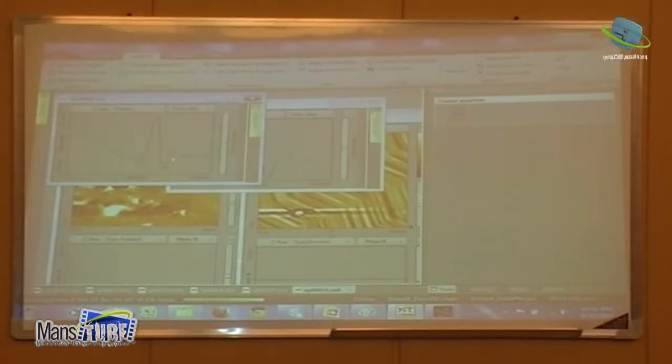And this is, let's say, the depth of my hole, from here to here. It's about 80 nanometer. So I make an 80 nanometer hole, and then the material outside, from this side and from that side. In total, the volume up is much greater than the volume down. Including the material, it's like 250 nanometers in total. When you scratch 80, you move material around like that.